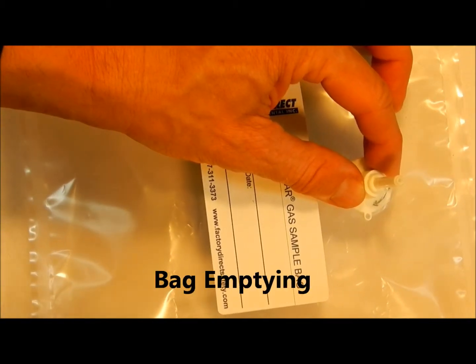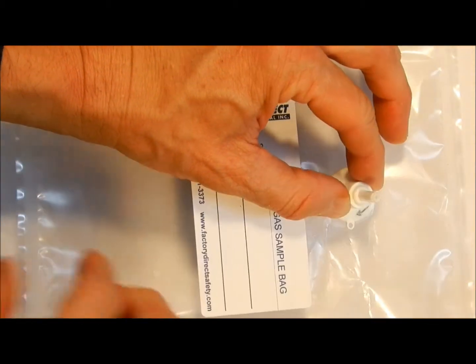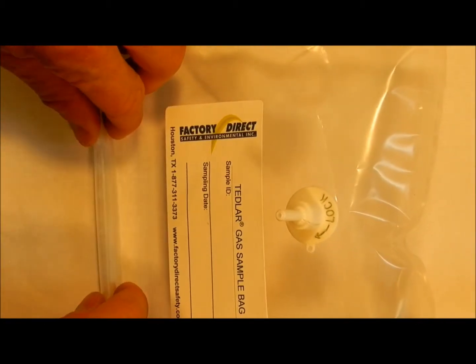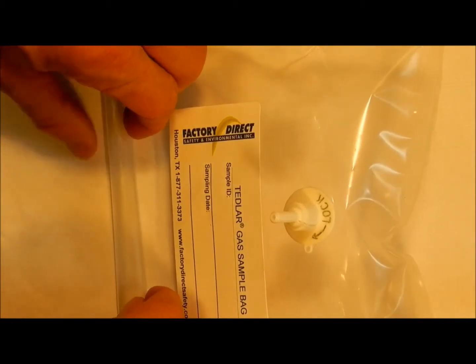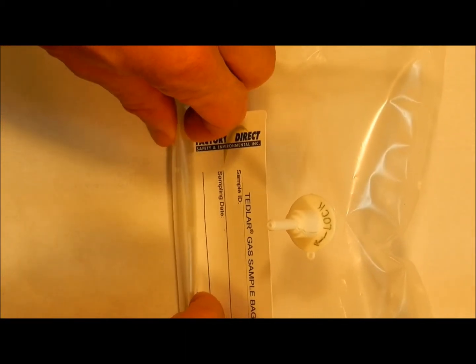On a final note, to empty the bag, push in the stem to open the valve and roll the bag up from the end in such a manner so as to avoid folds and thus avoid forming kinks that might later result in a leak in the bag.